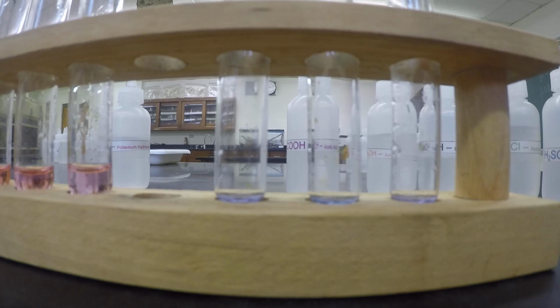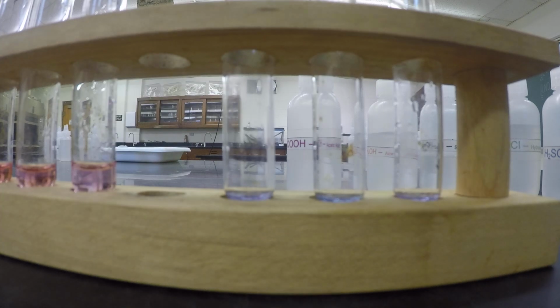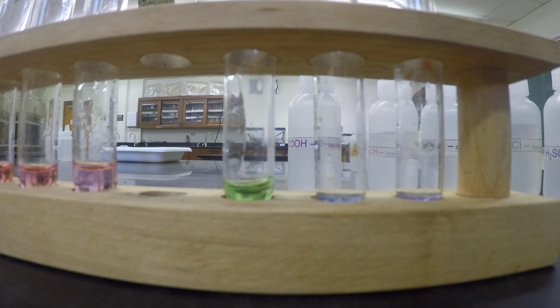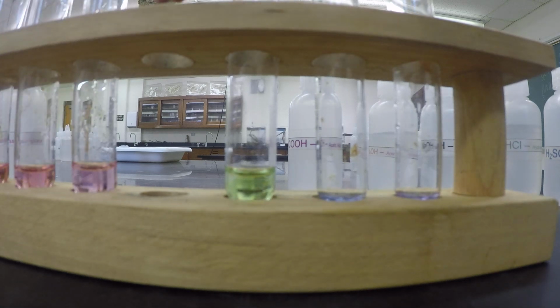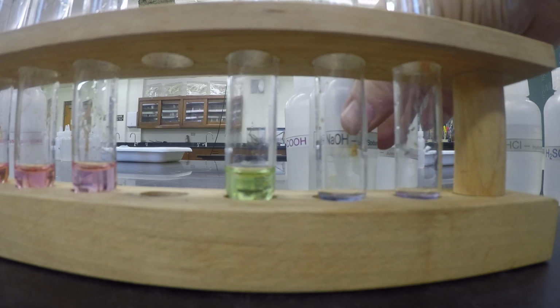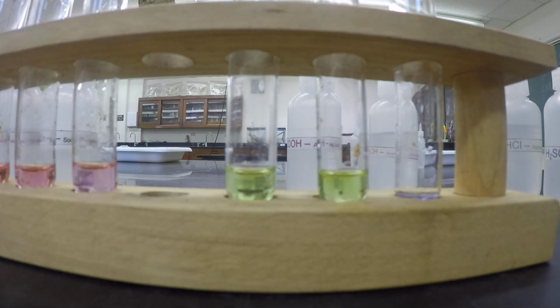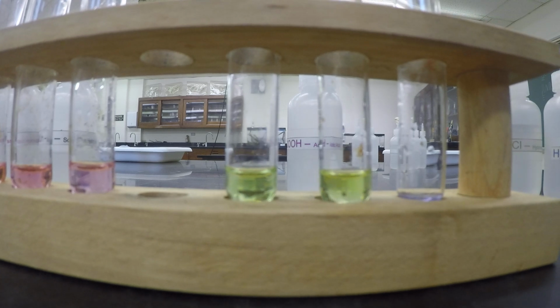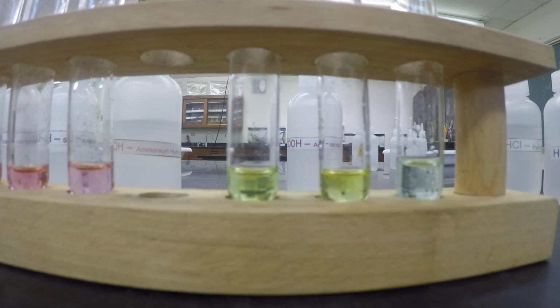Okay. These have the indicator already in them, and I'm going to add the 3 bases. So I'm going to start with potassium hydroxide in this test tube. Okay. I'm going to put sodium hydroxide in the next test tube. Very green. And I'm going to put ammonia hydroxide in this last one. Also a green color. It's not as green, but it's still a green color.